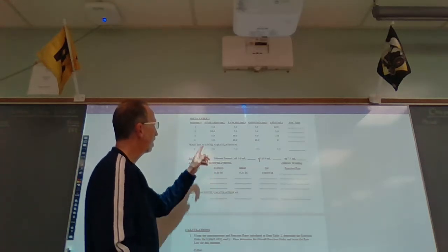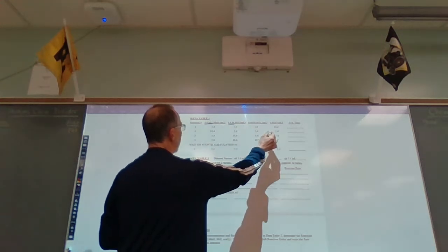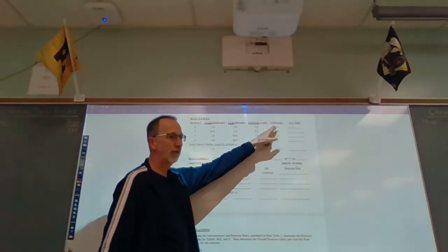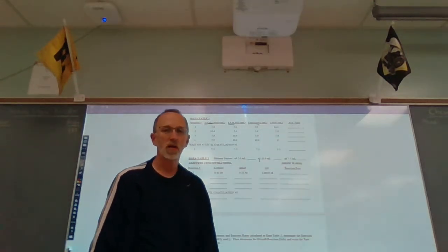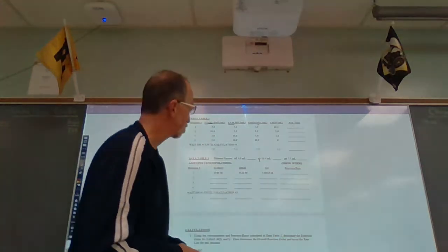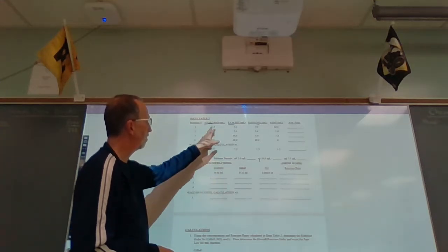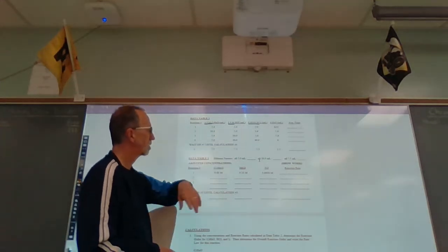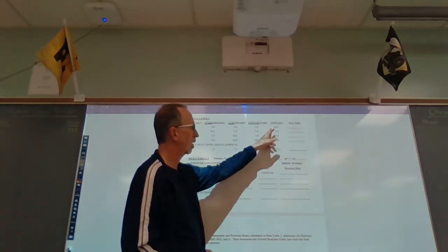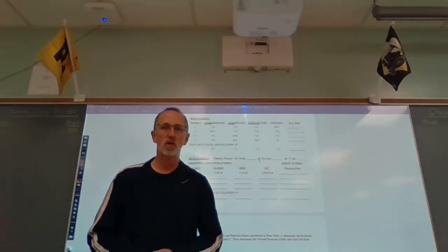And as you can see, here are our 3 reactants: 4 molar acetone, 1 molar HCl, 0.0050 molar iodine. And we have a 4th reactant here, water, which is not part of the rate law, but acts as a volume equalizer. And I'll explain that shortly. As you can see in experiment 1, we're going to take 5 mLs of acetone, 5 mLs of HCl, and 5 mLs of iodine. And to those 3, we're going to also add 10 mLs of water. If you add those up, we get 25 mLs total.